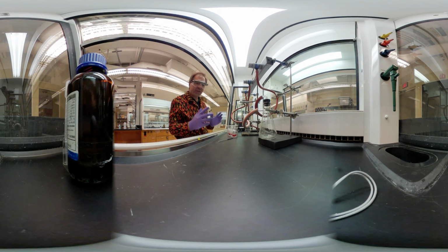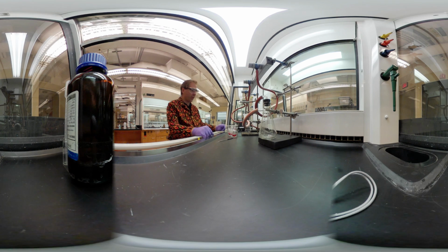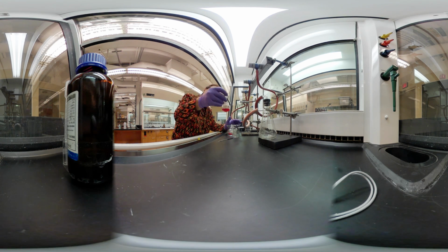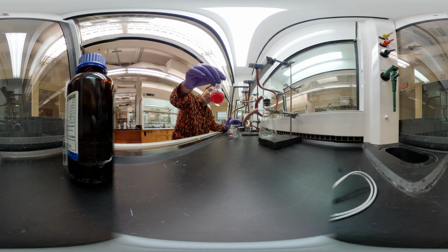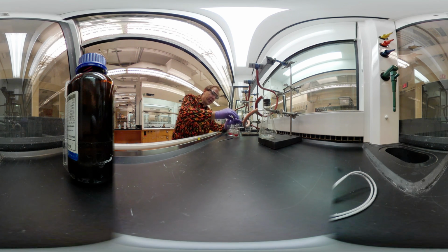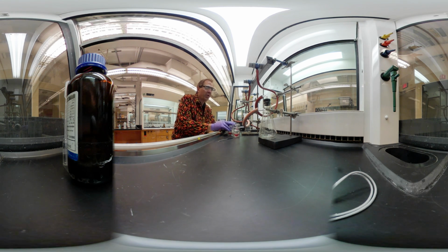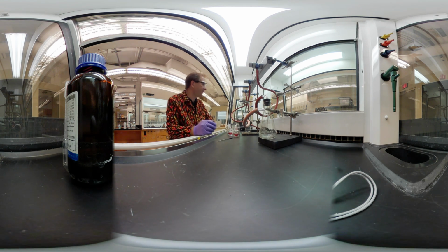Okay, welcome back to the fume hood where we do our filtrations. We have a small amount of material, so we're going to use the Hirsch funnels again. And as you can see, after 20 minutes of stirring, we've got this nice red liquid. Now, the material we want is actually in the liquid. So we've got some extra of that oxone and the salt and some junk there at the bottom that we don't want. So we need to make sure that these are very clean here.